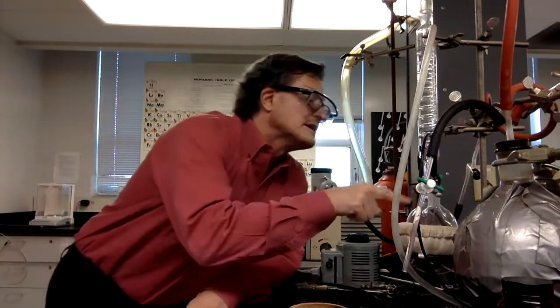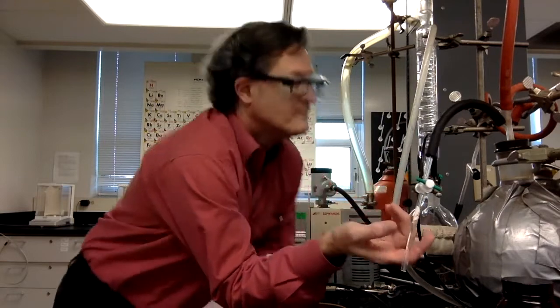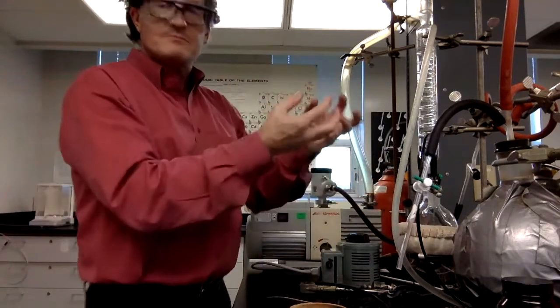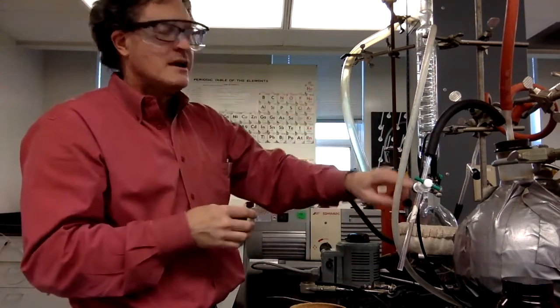But now we look in here and we take a look at where the temperature probe is, and it should be up here in the vapor phase. It's the temperature of the vapor that we want to measure, not the liquid. So just take a look and make sure that the thermistor has not gone all the way down into the liquid, right? We don't want to know about the temperature of liquid. We want to have the vapor condensing onto the temperature probe, and we're measuring that temperature, right?